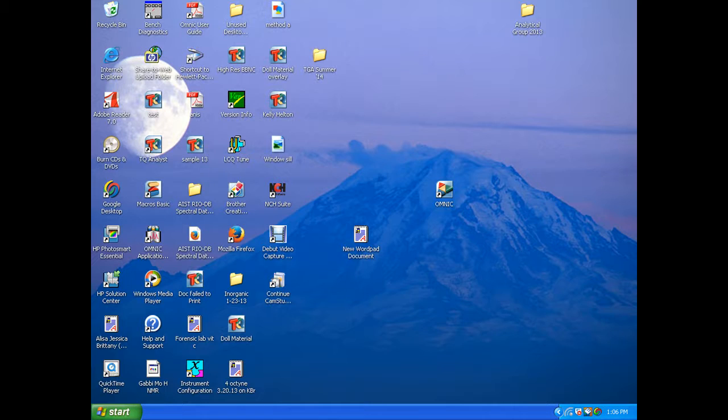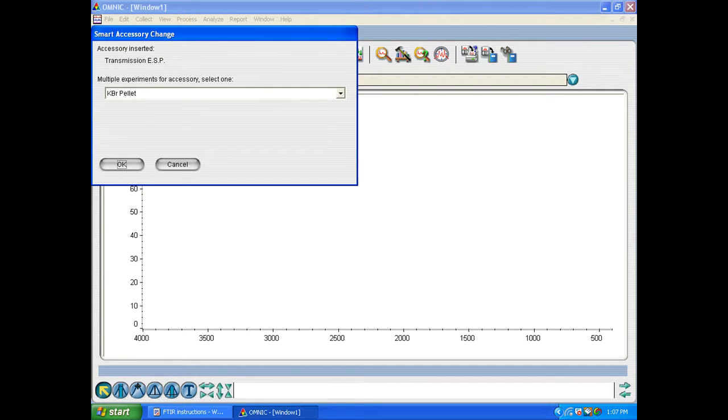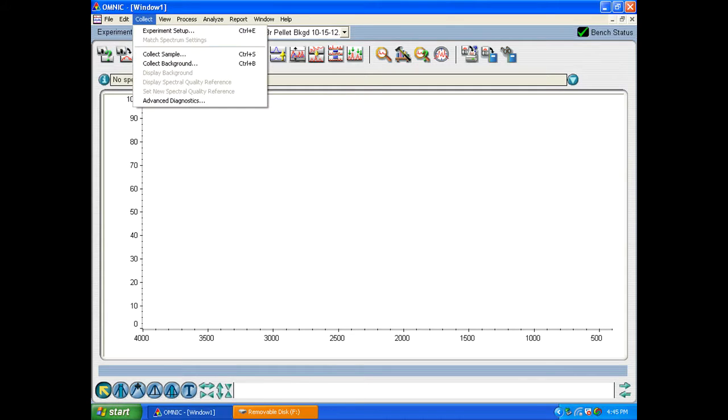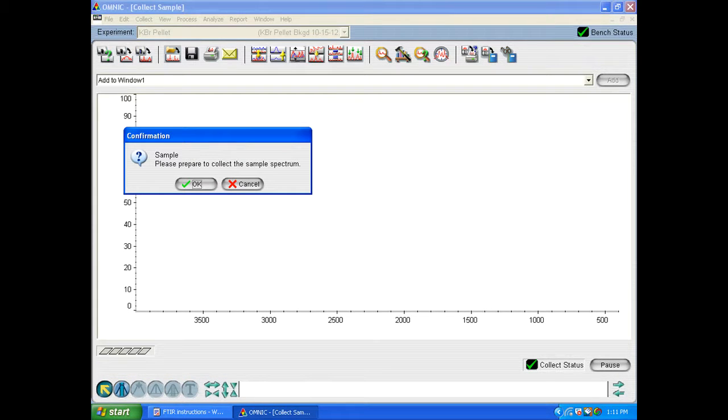So now that we have our KBR pellet made and we've placed it into the IR, now we can go ahead and run the experiment. So to do that we want to open up OMNIC. You'll see a window that says smart accessory change pop up and you just got to hit OK. So now we are ready to collect our data. To do that we go up to the top to the collect tab and then click the collect sample option there.